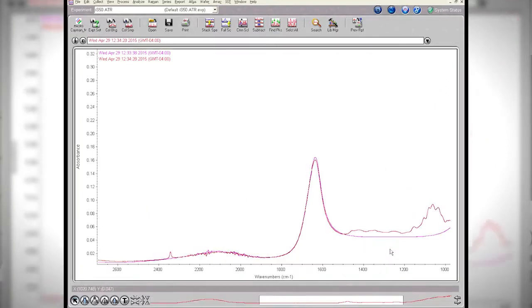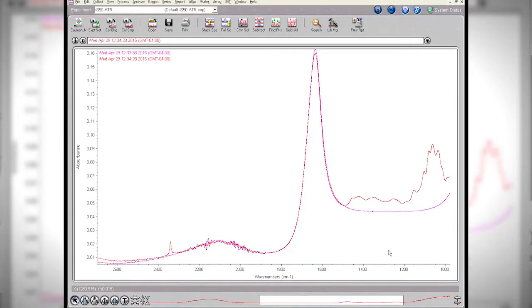So there are the two spectra overlaid right on each other in common scale. Let's zoom just on that part, which is where the interest is, and again, common scale. When you do that, or we can offset them just a little bit, it'd be easier to see if we offset them just a little bit. You can see here, this peak is repeated in both. Well, that's the water, and the majority of the soda is water. But you also see all of these peaks, and a sharp little peak right here. Those peaks to the right there, the low frequency, those are sugar peaks. That's from the sugar that's in the soda.